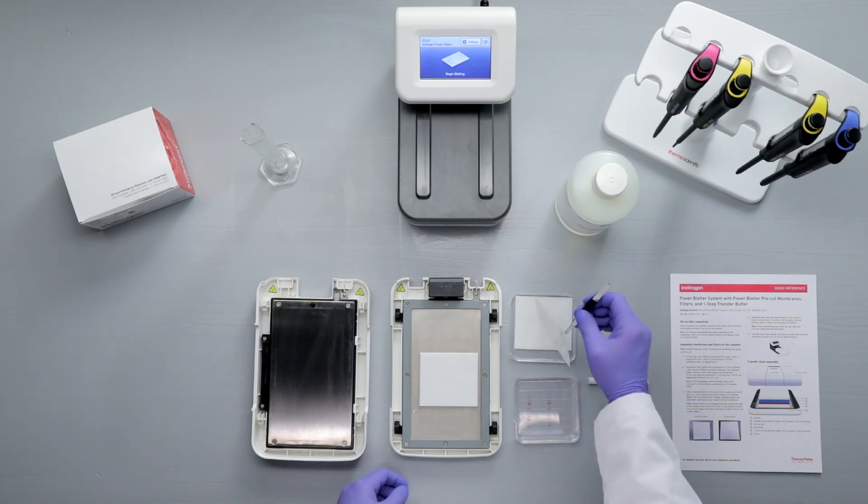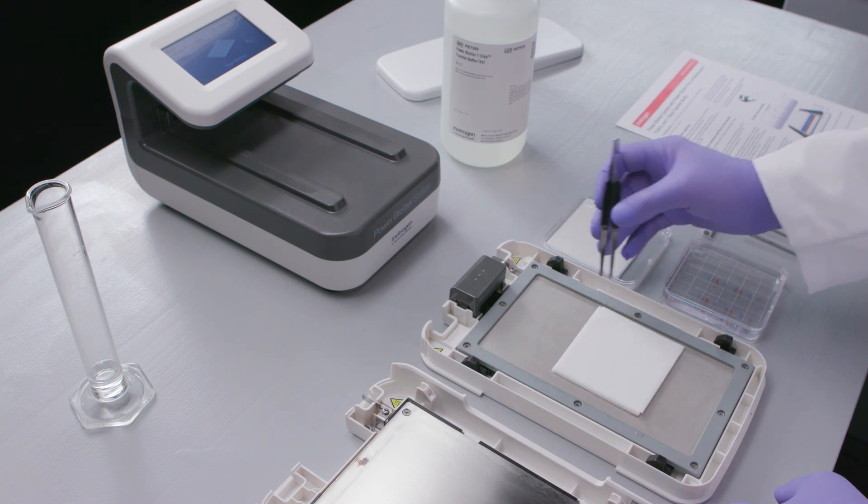Place the membrane on top of the filter papers and remove any trapped air bubbles using the blotting roller.